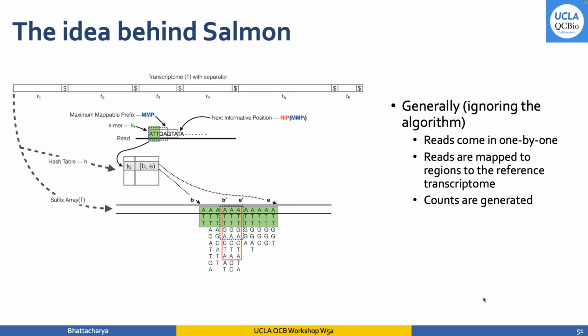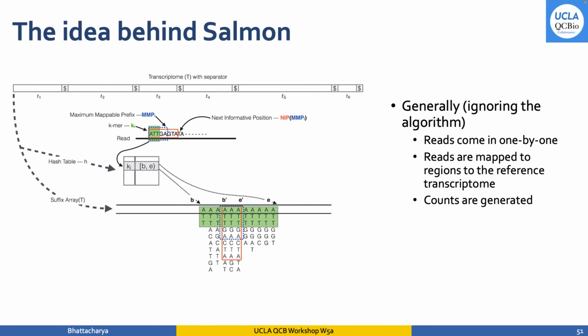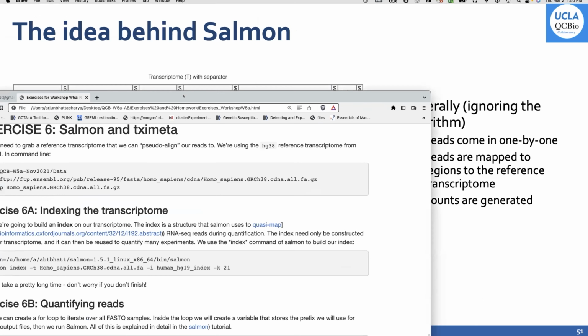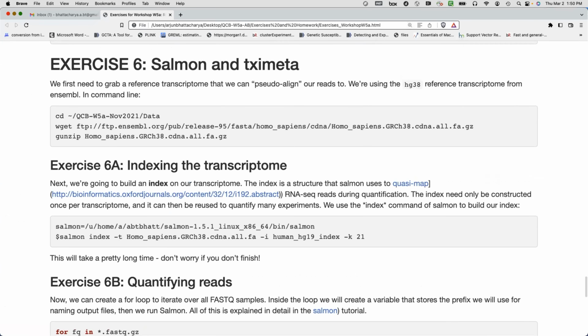Okay, so let's. Oh, there's a chat question. No, okay. All right. So let's now switch to the exercises again, and what we'll do first is quantify the reads, and then we'll come back to the slides when we import our data.